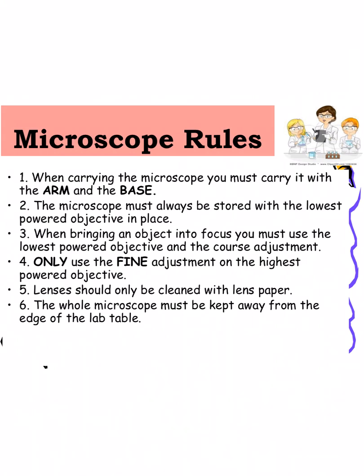The lenses should be cleaned with lens paper. And finally, the whole microscope must be kept away from the edge of the lab table.